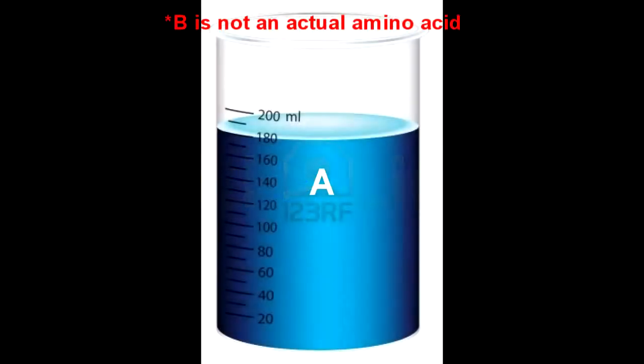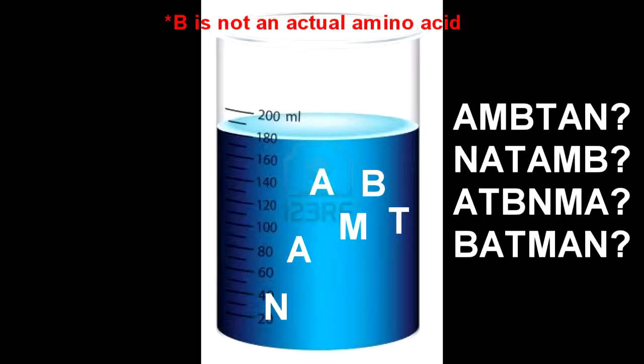Even at short lengths of 3 or 4 residues, we start to run into difficulties when using the liquid phase peptide synthesis techniques. If we simply tried to synthesize the peptide we wanted by adding in every single residue it is composed of, we can't be guaranteed in what order these residues will attach to each other. Therefore, we can assume that every permutation of arrangement could be present in solution.